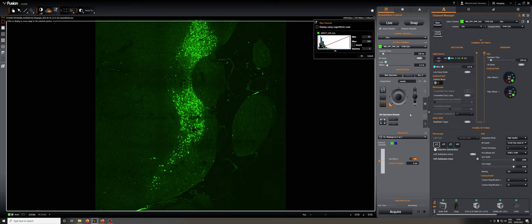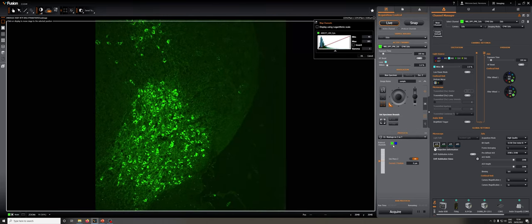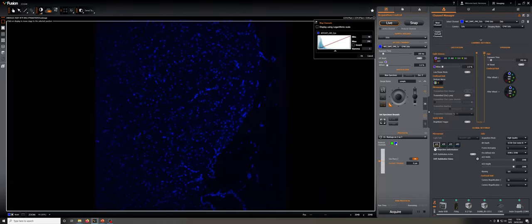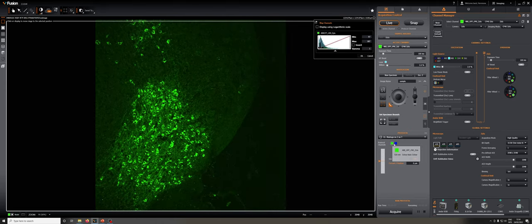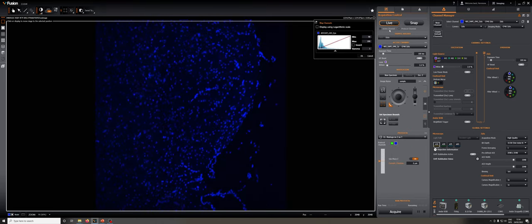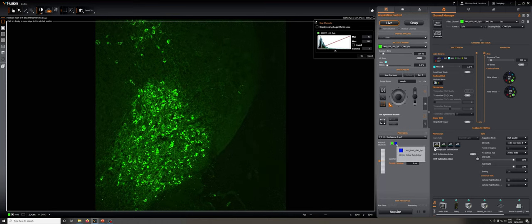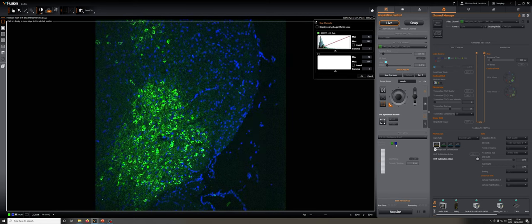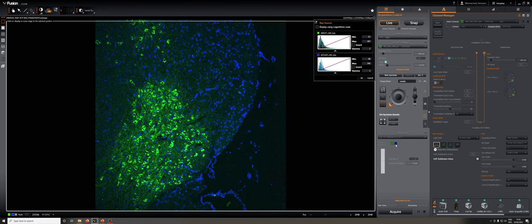There are a few other useful things we can do in acquisition control. For example, we can change the particular channel we're looking at. If we go to live, we can switch between our protocol channels — meaning the channels in our protocol manager — by clicking here. If this is engaged on active channel, we see just the particular one that's highlighted. If we switch to protocol channels and go to live, it will do both channels, displayed live and updating as we move.